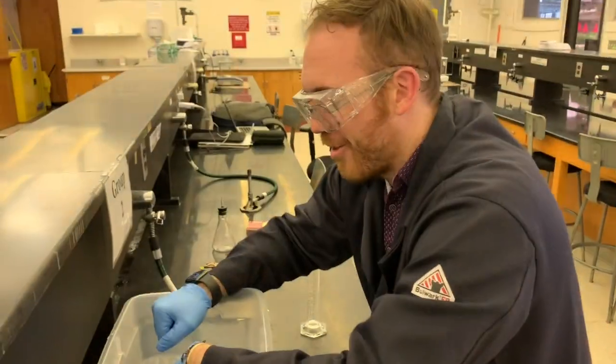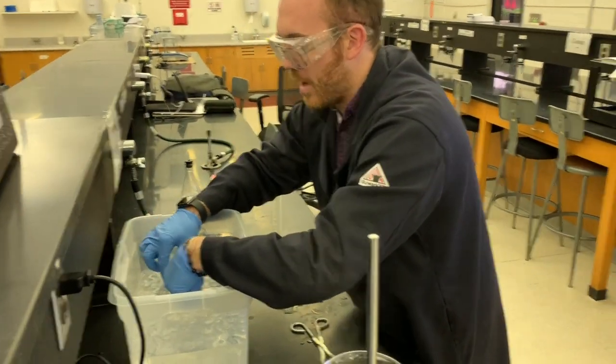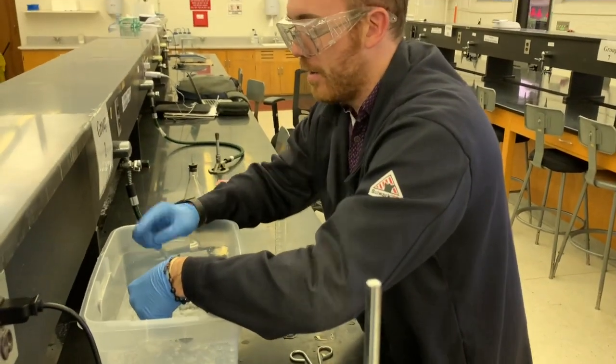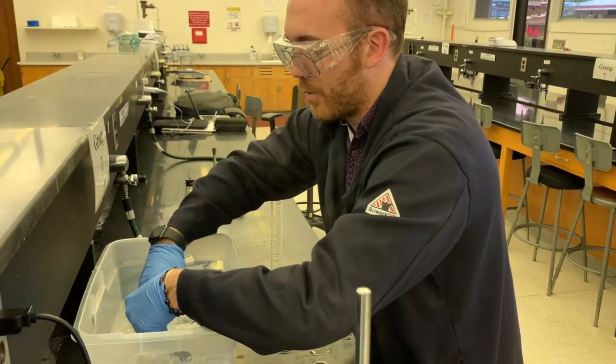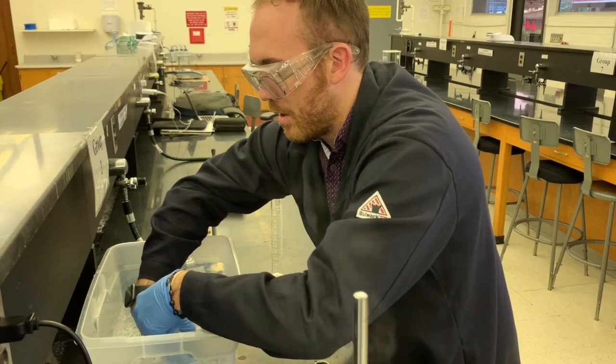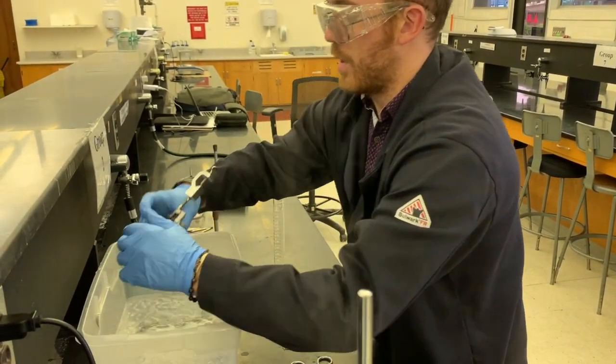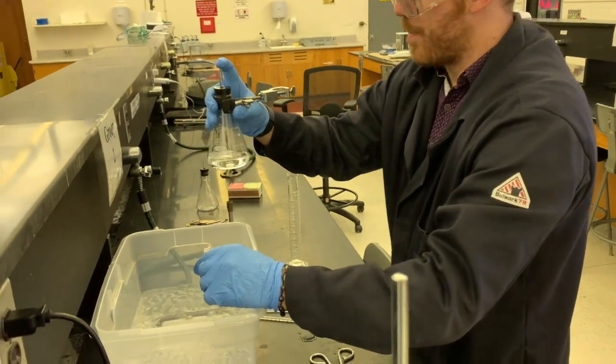Well, hey there. So, welcome back. Basically, we're going to, at this point, take our finger and make sure that we keep all that liquid inside of the flask. So we're gonna cover up that hole again, making sure not to knock off the tip. And we're going to pull it back up.